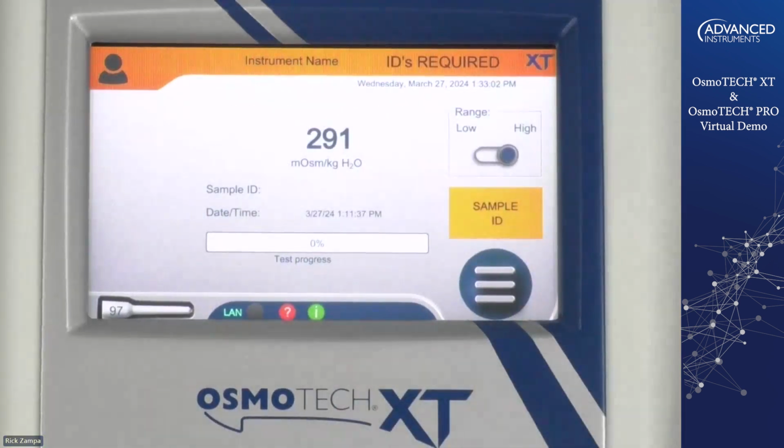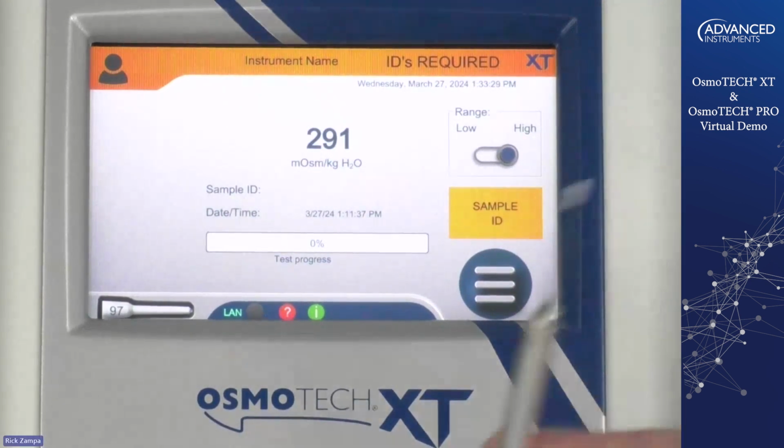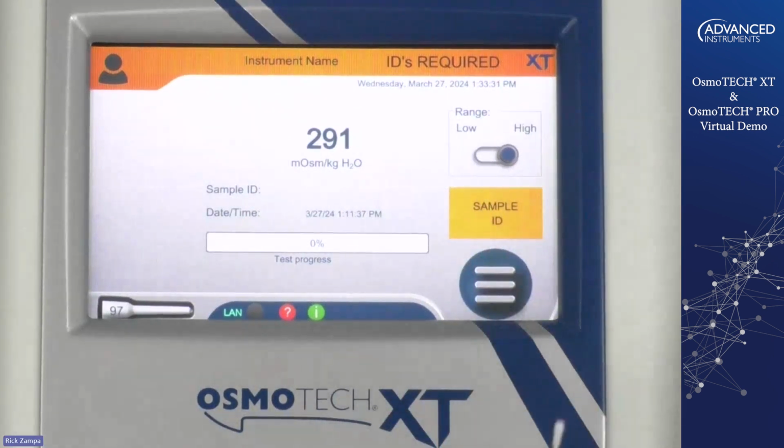And we're back. Thank you, Rick. One more question, referring to the first question answered earlier regarding sample volume. You just mentioned that sample volume does matter and you want to wipe off that excess, but does sample volume really affect osmolality? Our sample volume for this test is 20 microliters. So to answer your question, yes, you want to be at 20 microliters.